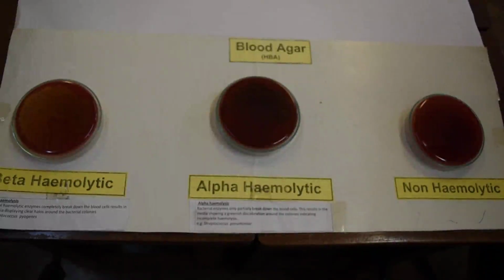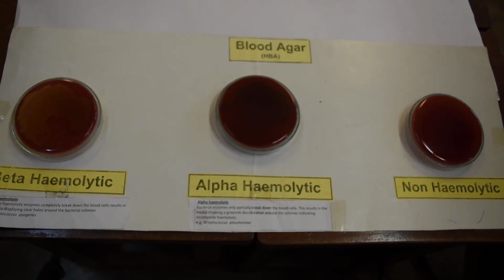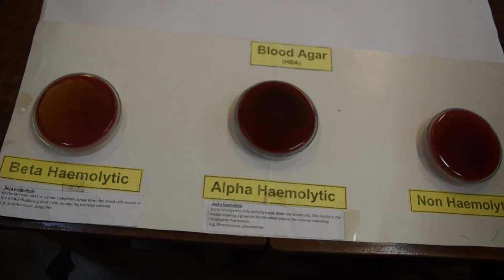We will discuss Streptococcus identification using colony morphology, their Gram stain appearance, and their ability to grow on different media, like the basic media we use in the lab: blood agar, MacConkey agar, and chocolate agar. You can see there are differences in different streptococci groups, so you can use those specific features to identify different groups of streptococci.